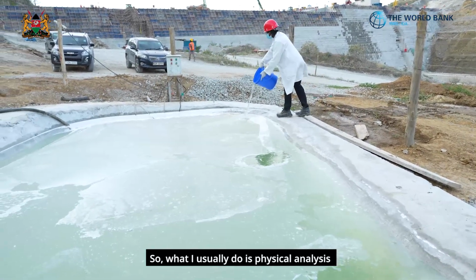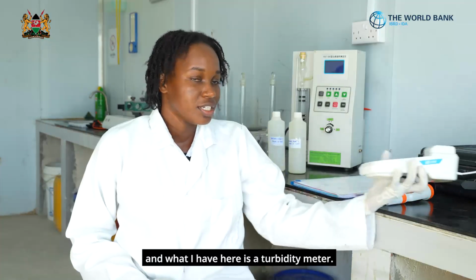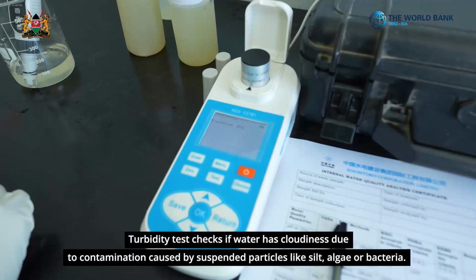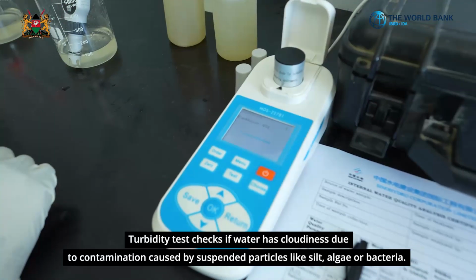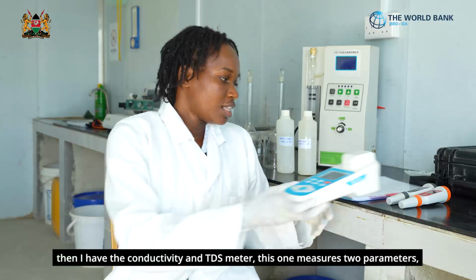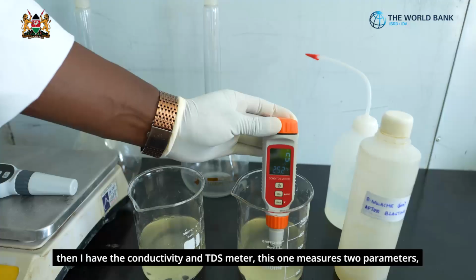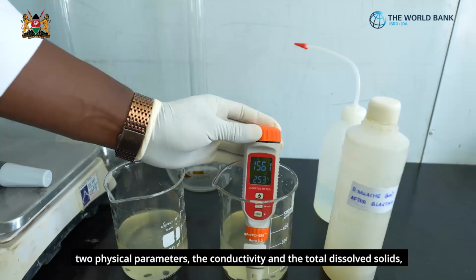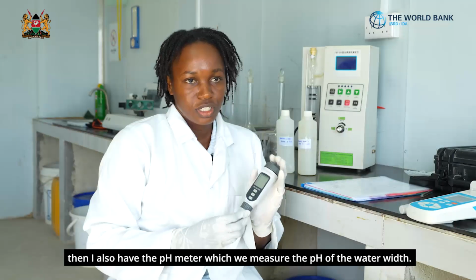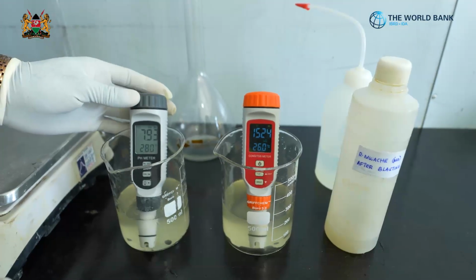So what I usually do is physical analysis, and what I have here is a turbidity meter. This one we use to measure the turbidity with it. Then I have the conductivity and TDS meter. This one measures two parameters, the conductivity and the total dissolved solids. Then I also have the pH meter, which we measure the pH of the water with.